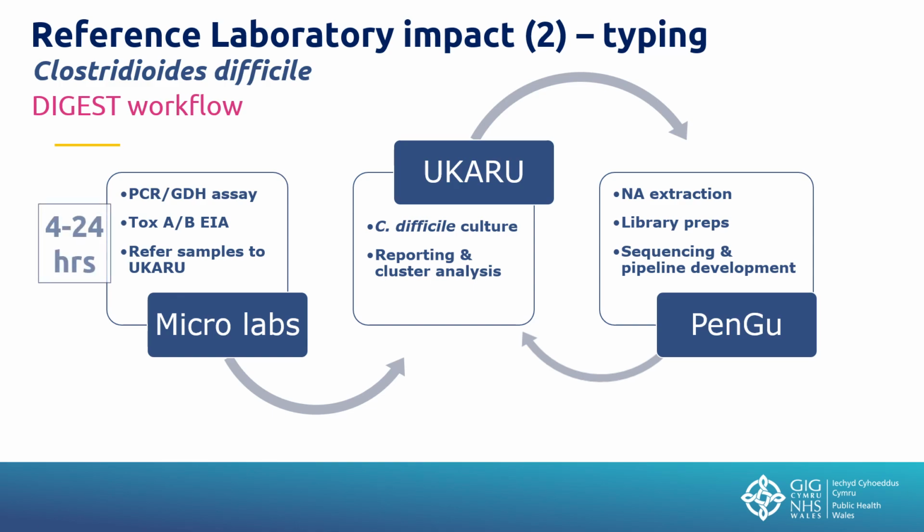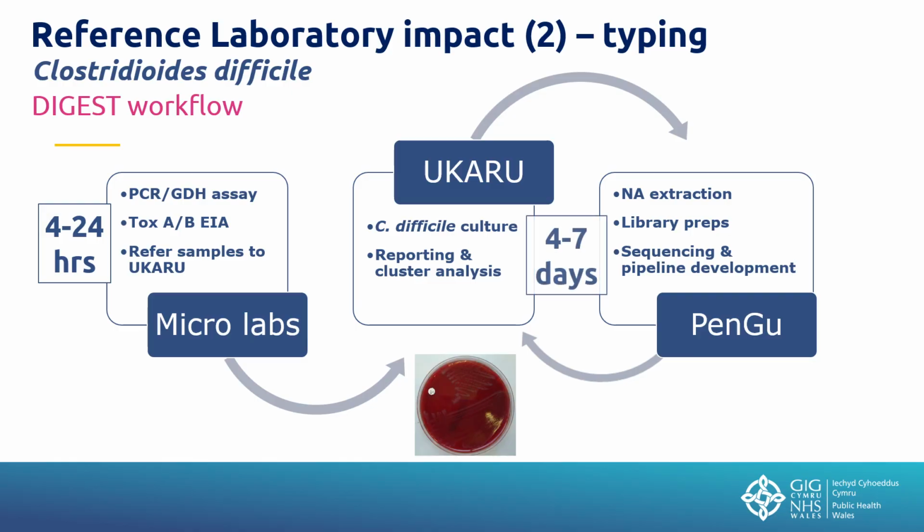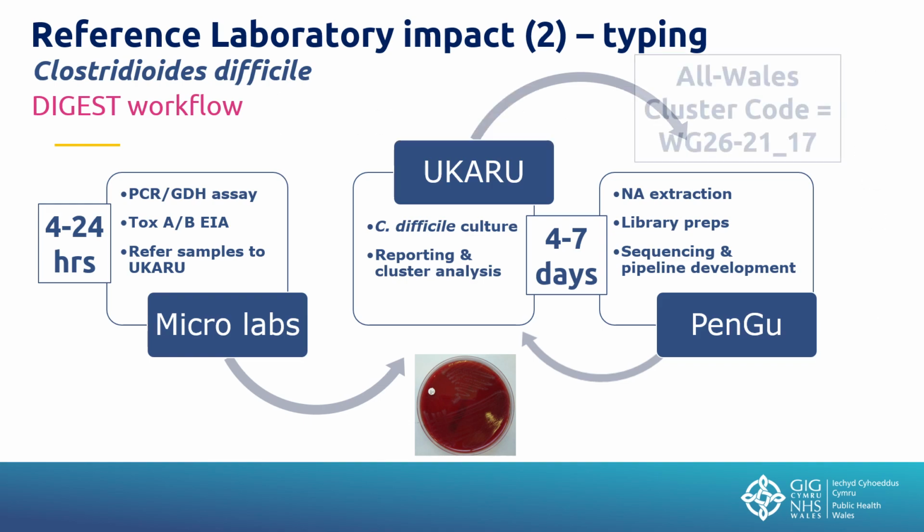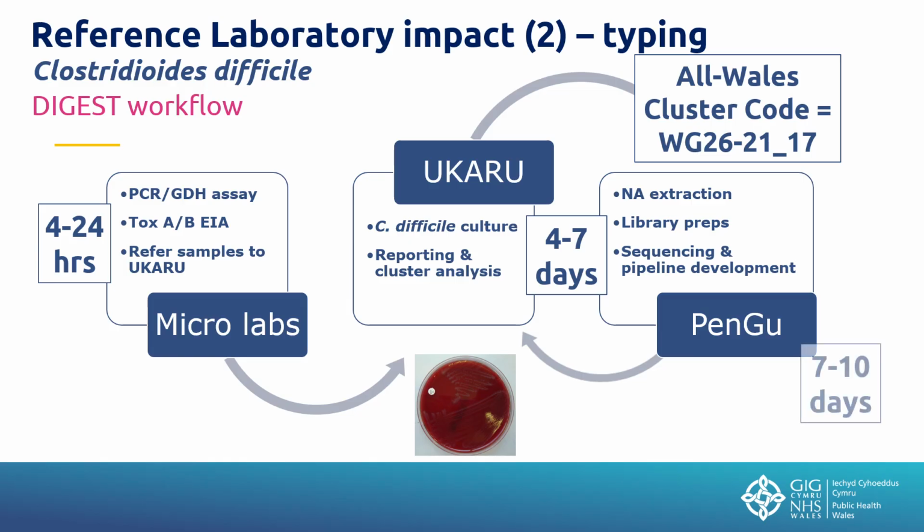The first part of it is done, obviously, in the clinical laboratories. That takes 4 to 24 hours, and then another up to a week for the process to be cultured in our lab, and then for the DNA sequencing, the whole genome sequencing, to happen within our pathogen genomics laboratory, and we end up with a cluster code assigned to strains that are related, and the whole process now takes 7 to 10 days.